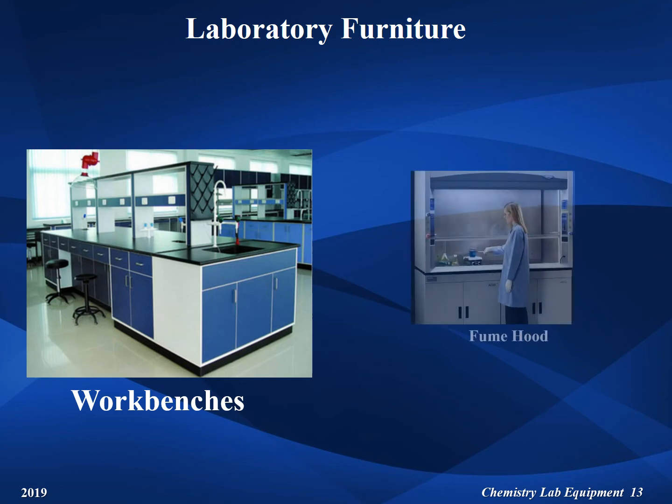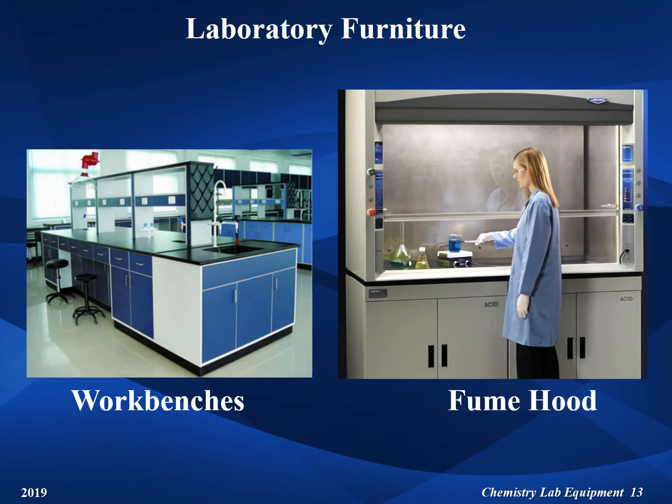This photo shows a chemist working in front of a fume hood. Most chemical reactions are set up and conducted in fume hoods for health and safety. They provide a way for air containing noxious fumes to be drawn out and filtered before being released into the atmosphere. In addition, the thick piece of safety glass protects people from the dangers of spillages, fires, or explosions.